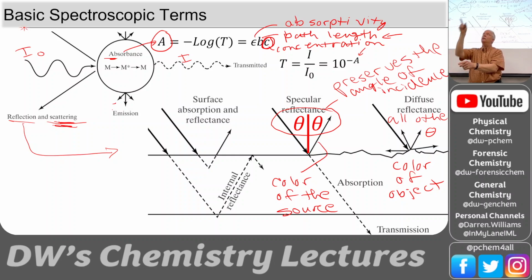It's white because the light is white, not the surface. At all other angles, the surface is black. But when I get to the specular reflectance of the light, preserving that angle of incidence, I'm looking at the source. If this surface was smoother, then I would really get an image of the source.